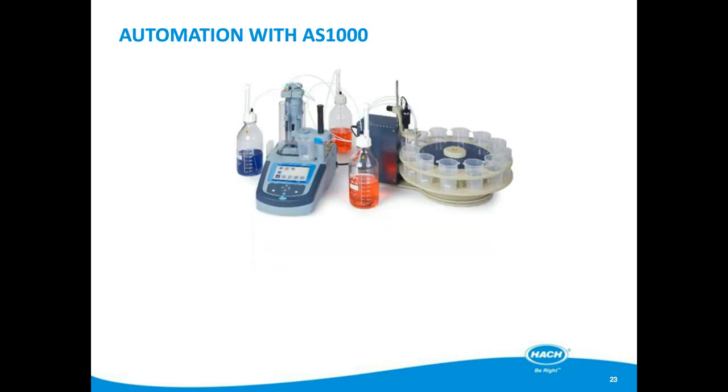Other feature: if you have a large series of samples, you can automate. You can connect a sampler to the titrator, and we have different capacities of sampler. The system will automatically perform the correct titration in each beaker.